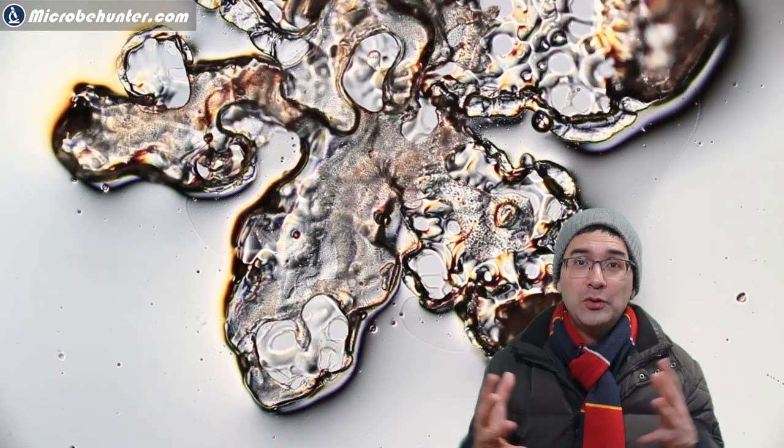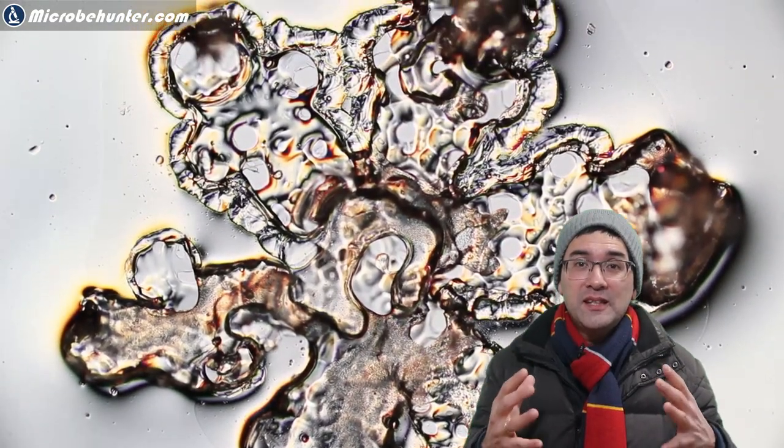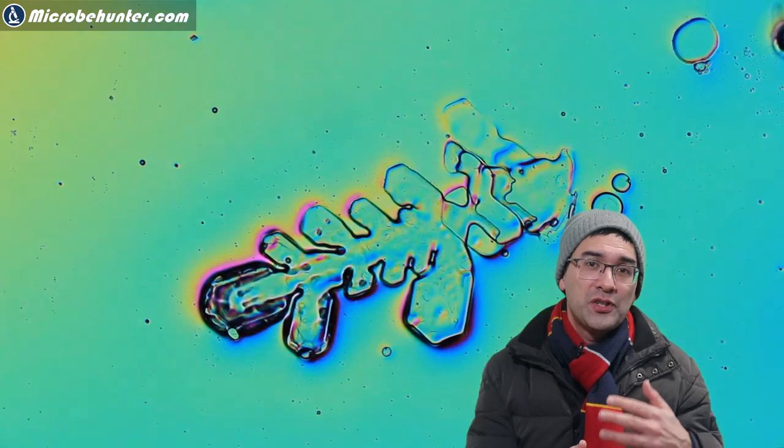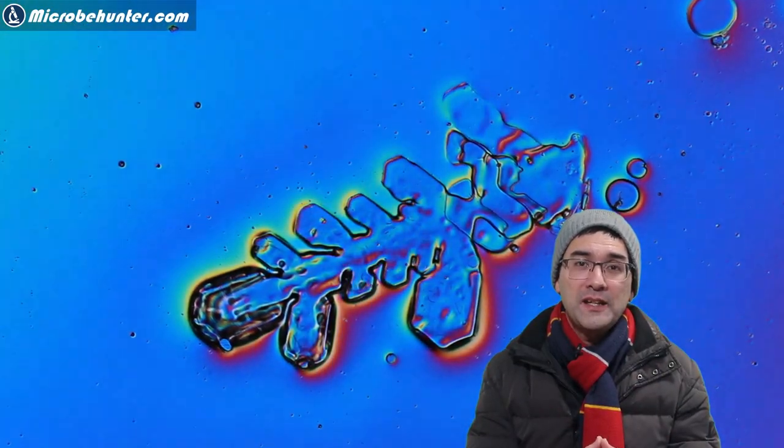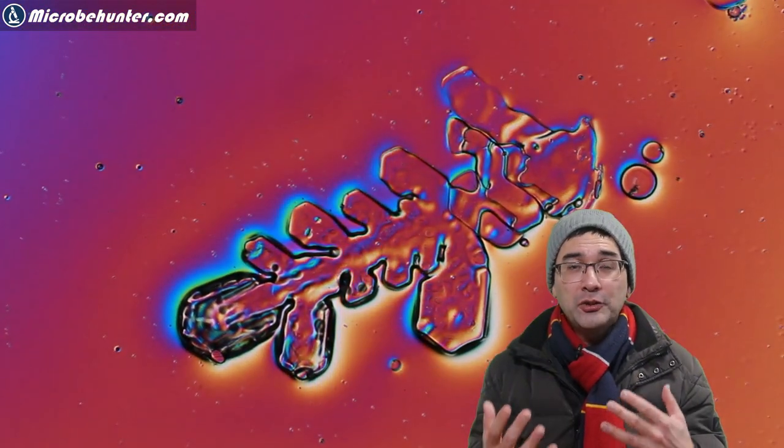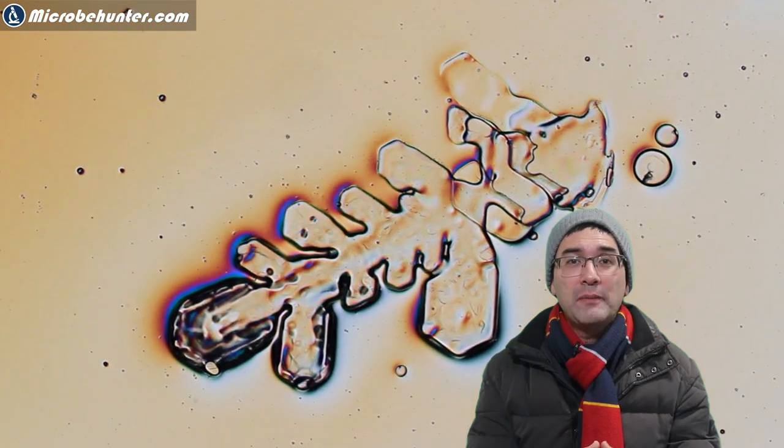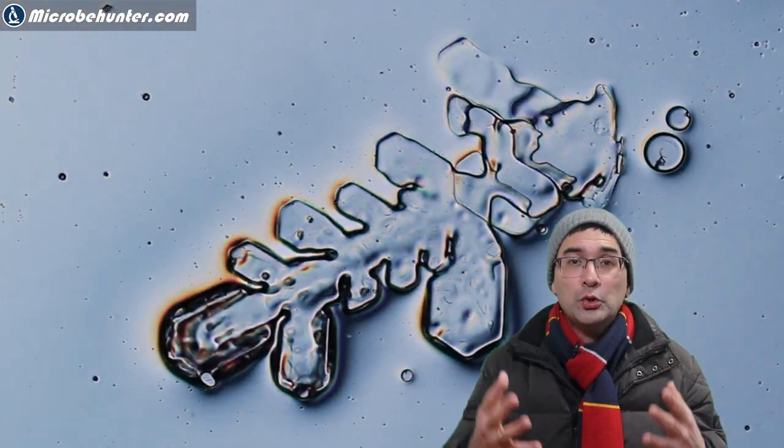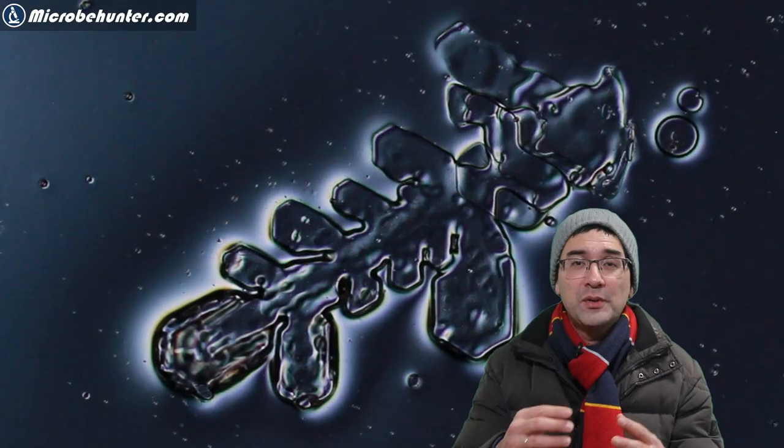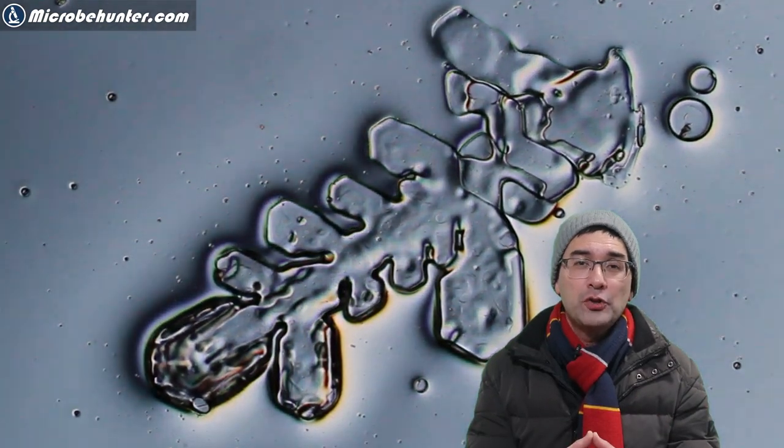But occasionally I do see a hexagonal, a six-shaped snowflake and sometimes I also saw some of these parts of the snowflakes. Now if you're kind of wondering a little bit about the colors, this is because I used polarized light to look at the snowflakes and I was actually rotating the polarization filters.